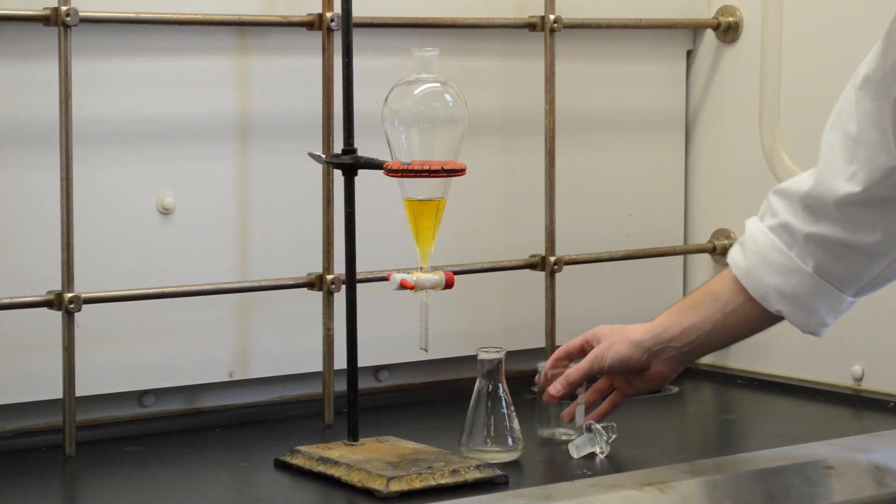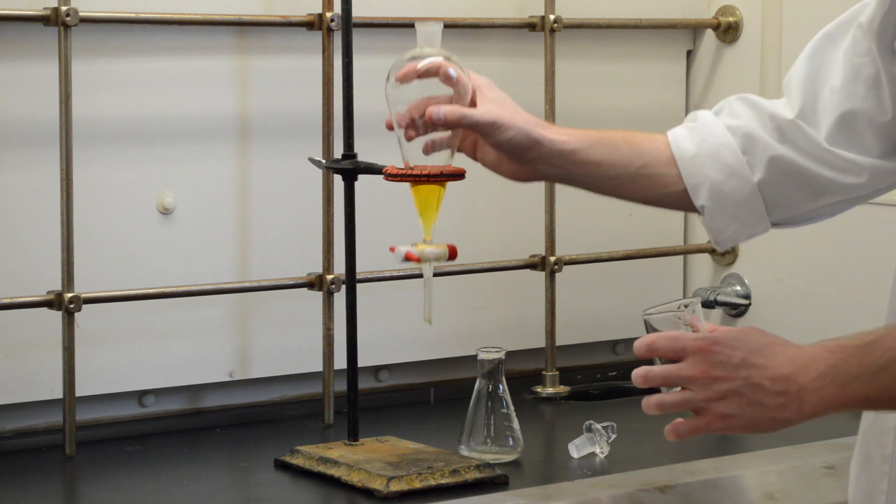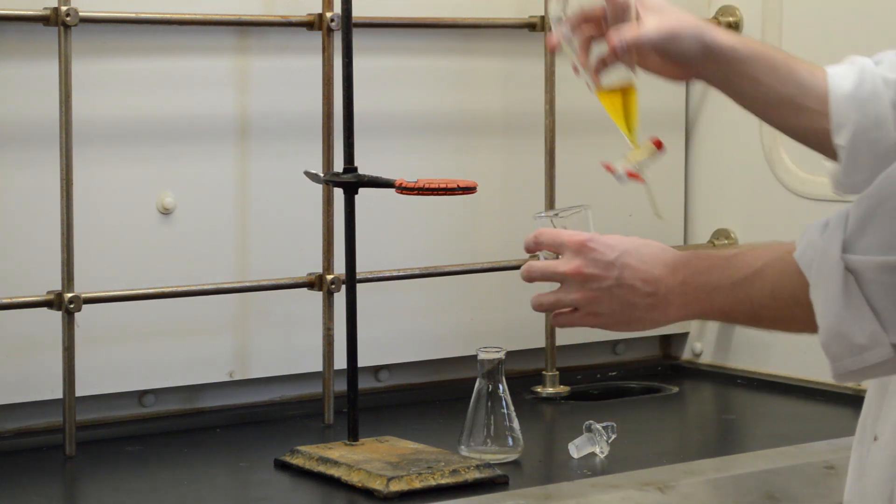We let the bottom layer run through the bottom, but when we're collecting the top layer, we want to be sure to pour it through the top of the separatory funnel instead.